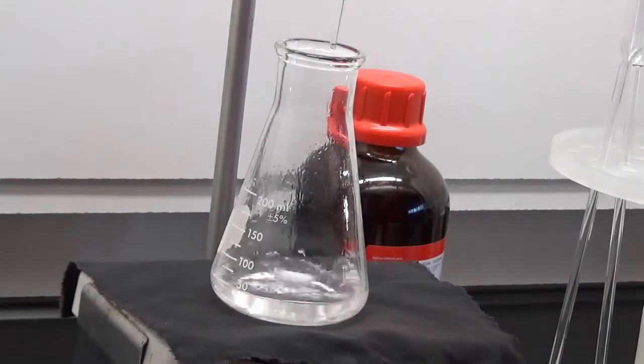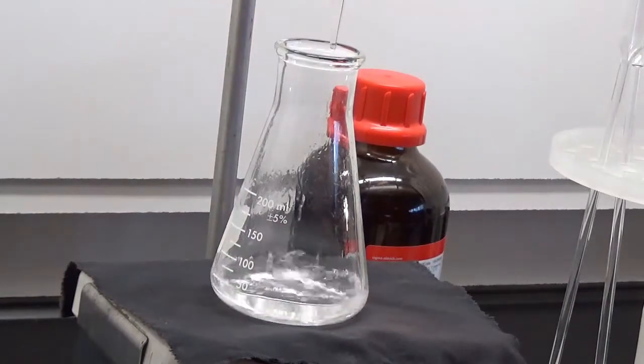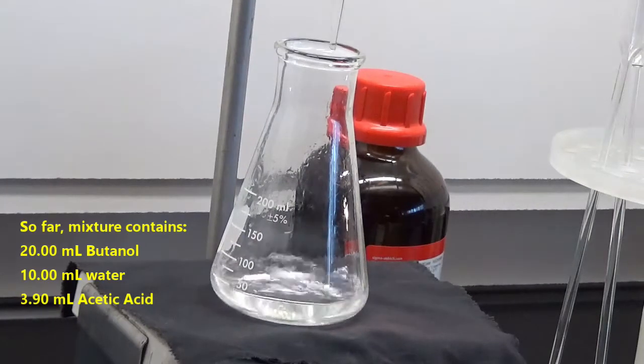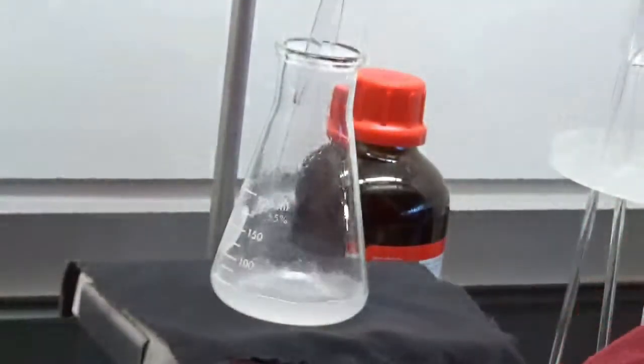And now I am at, oh boy, I'd say 3.90 milliliters. Guess what? I add another 5 milliliters of water, and I'm going to get back in the turbid range, back in the two-phase region. God, it's so clear now. 5 mils. I'm going to cloud right up.